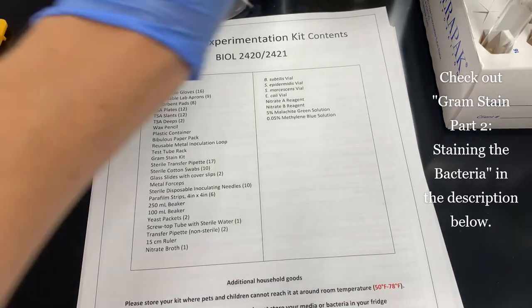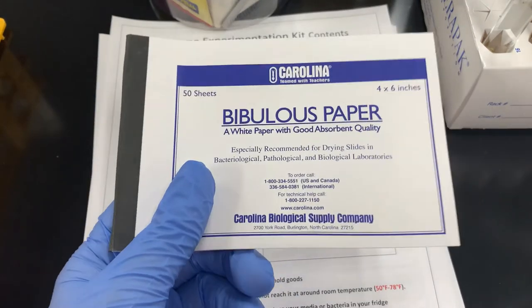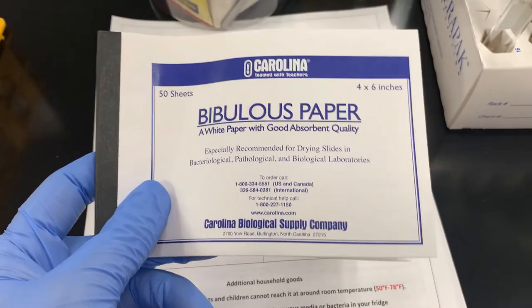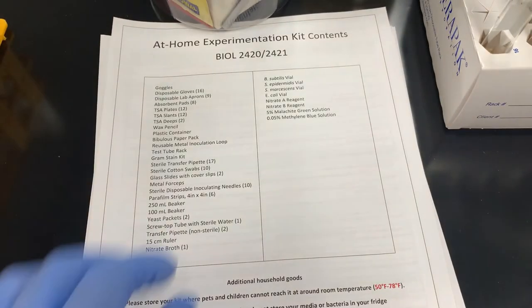Bibulous paper pack, here it is. That's also going to come in your plastic tub. This is more than you will need this semester. This is used for drying your slides after you stain them.